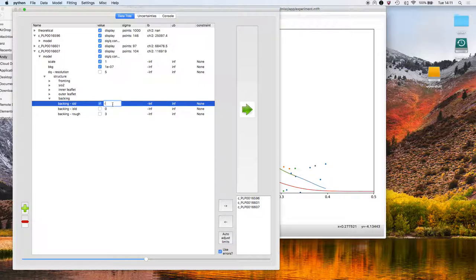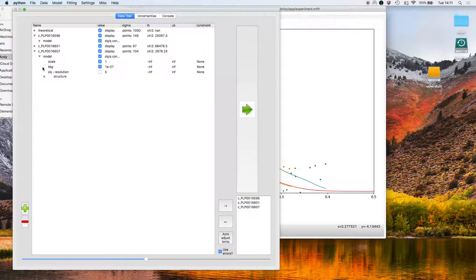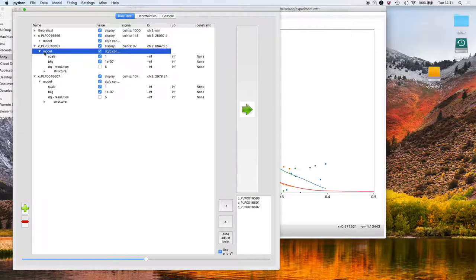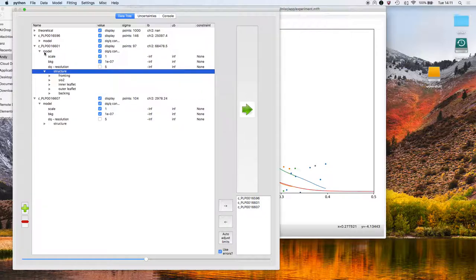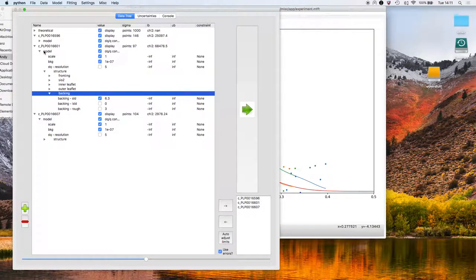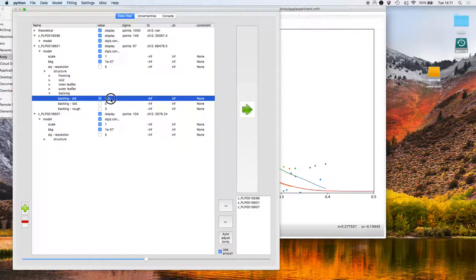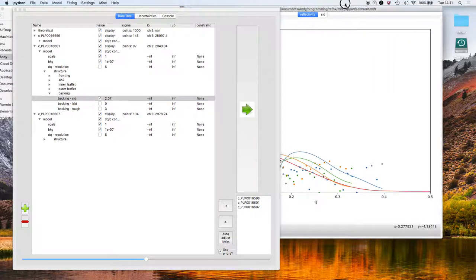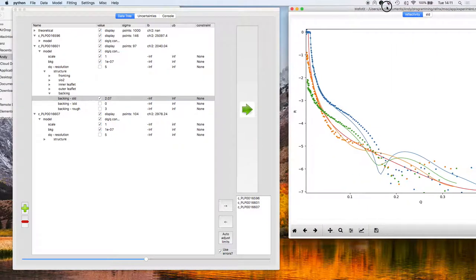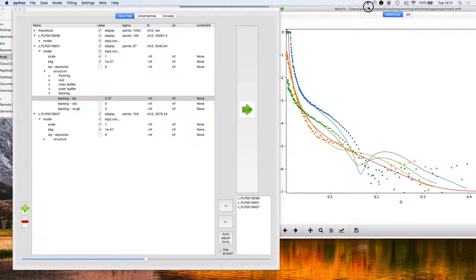The backing SLD for this contrast, this last one, is minus 0.56 because it's in water. For this one, it's 2.07, so it's silicon contrast match. We can see now that the models are starting to get a lot better.